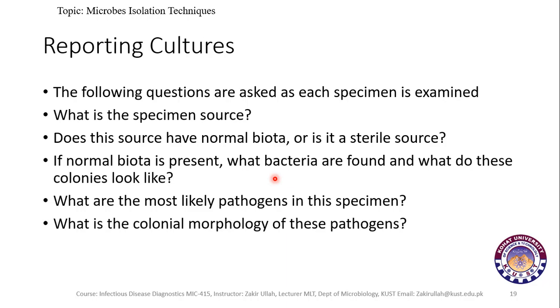What is the colony morphology of these pathogens? How do these pathogens look on the different types of culture media? Do they produce any color or any specific colony morphology, what is the size of the colonies, and what is the behavior of the colonies? All these are discussed when reporting cultures.